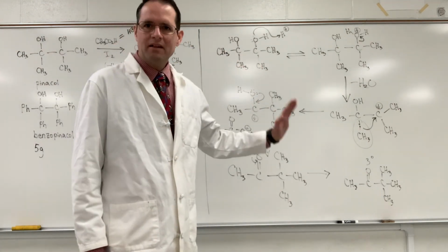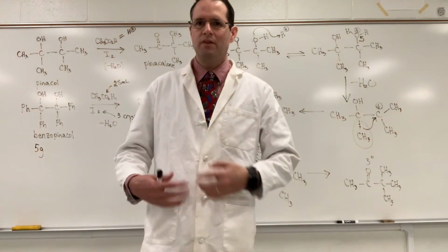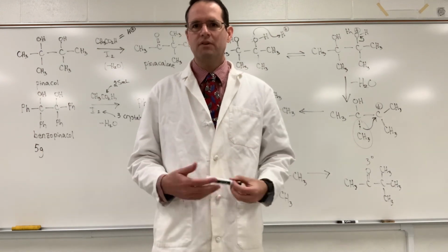So that's the lab, that's the detail behind it. Now let me go ahead and do the experiment so you can see things boiling and filtering and transferring, okay?